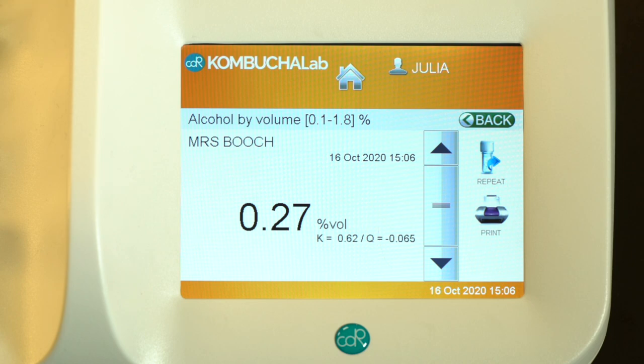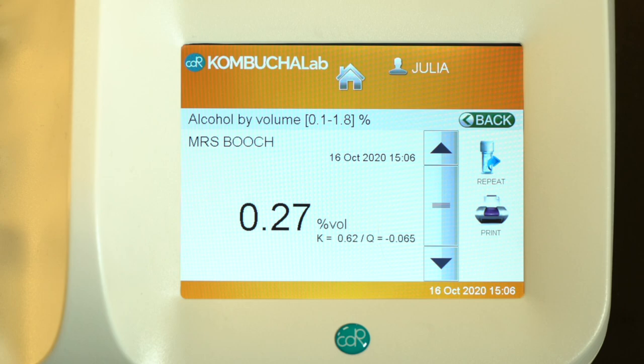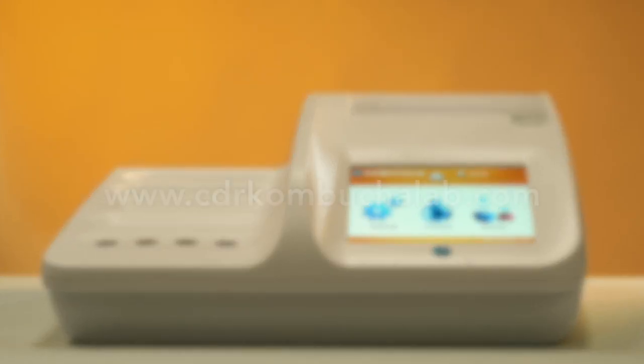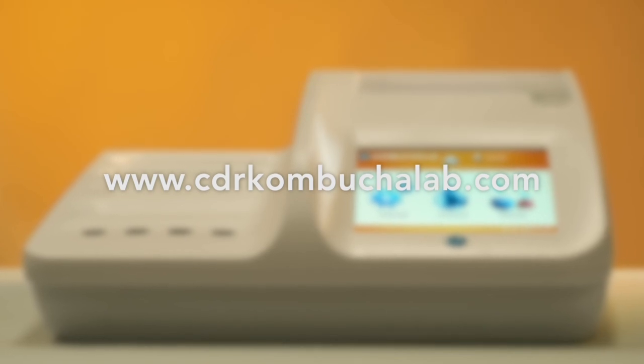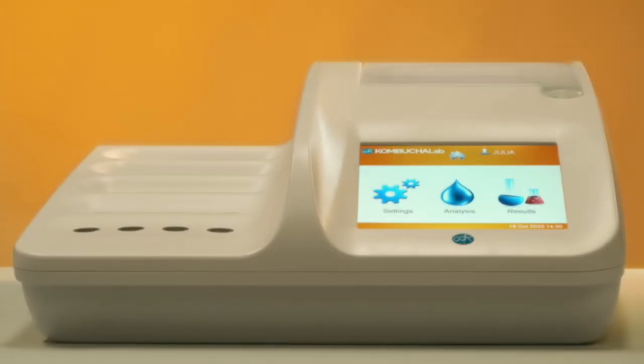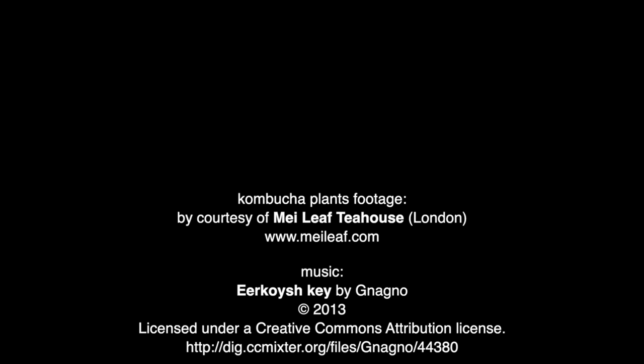Here you are, the result printed and shown on the display. For more information, visit our website at www.cdrkombuchalab.com.